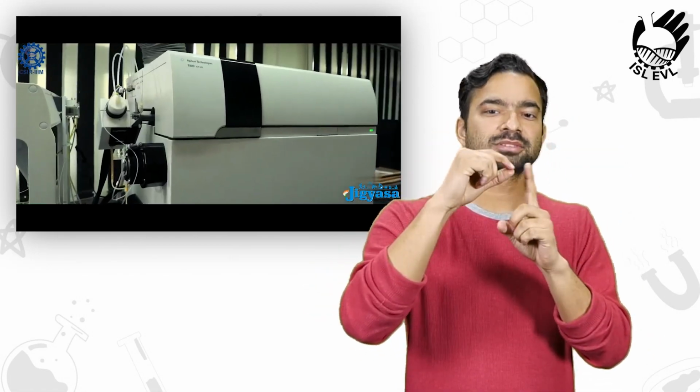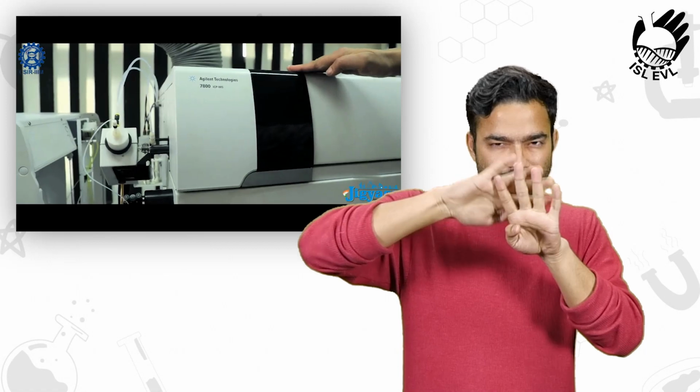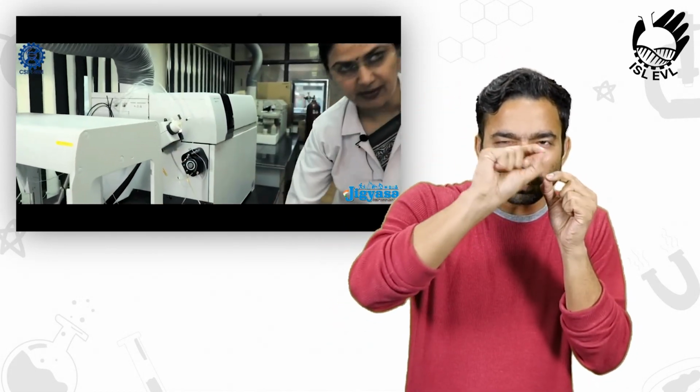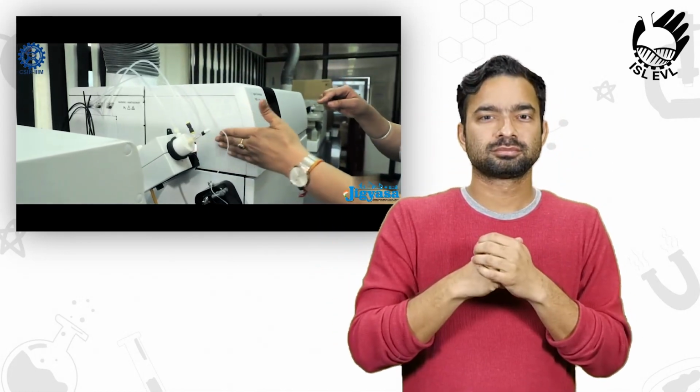This is the ICPMS, inductively coupled plasma mass spectrometer. This is the spray chamber. Here the plasma is going to be generated at a temperature of 10,000 degrees centigrade, and this is the mass. The sample is being taken through the auto sampler. The sample is coming through this pipe, through the peristaltic pump, going to the nebulizer for aerosol formation. The larger droplets are going into the drain, and the finer smaller droplets are coming inside.